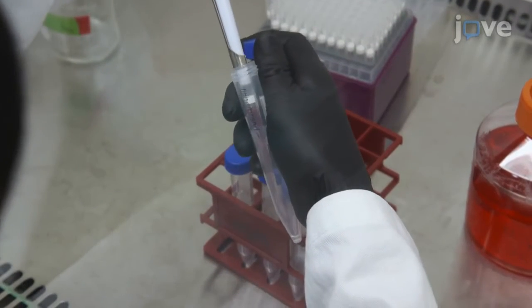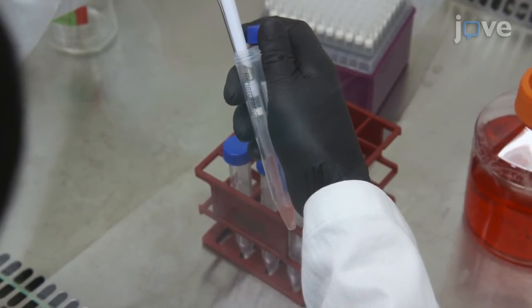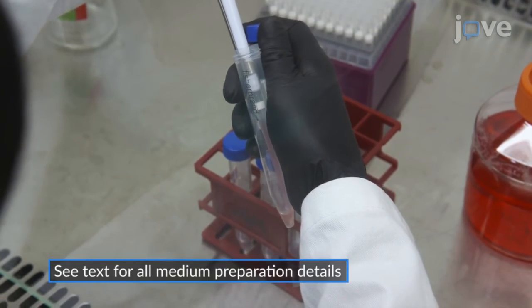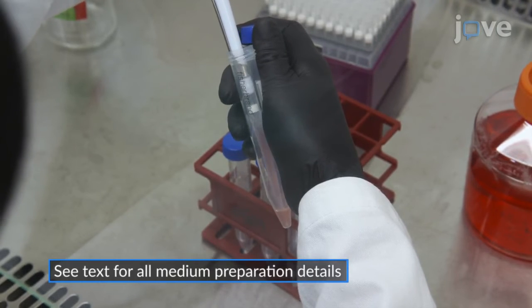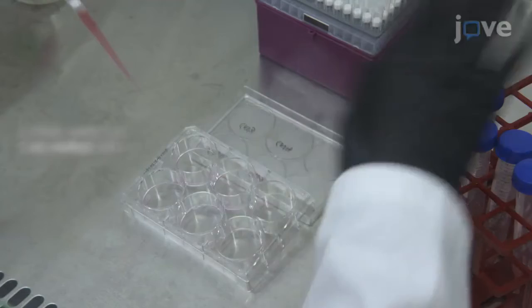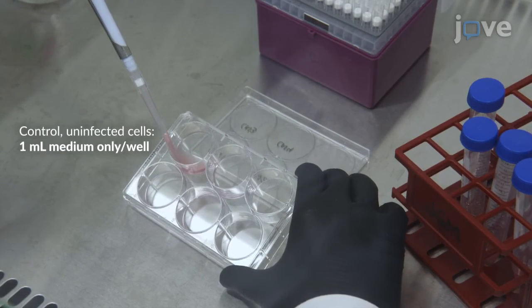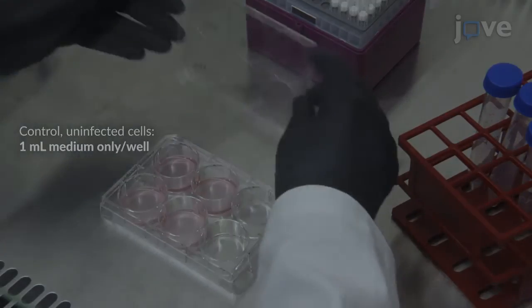After the last wash, resuspend the fungal cells at a concentration of 1.2 times 10 to the 8th cells per milliliter of antibiotic-free cell culture medium, and add 1 milliliter of fungal cell suspension to each of 4 wells of a 70 to 80% confluent 6-well macrophage culture plate.